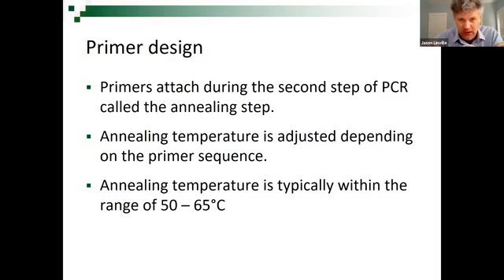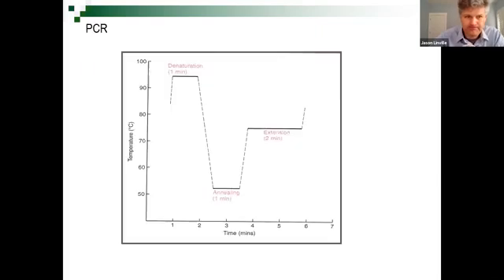The primers come with a suggested annealing or melting temperature on them, and you set the annealing temperature based on that. There's a great picture of it. Notice I keep saying 60. In this picture, it's probably around 53 or something like that. The annealing temperature can be anywhere in this range, and where it actually is depends on the sequence of those primers.